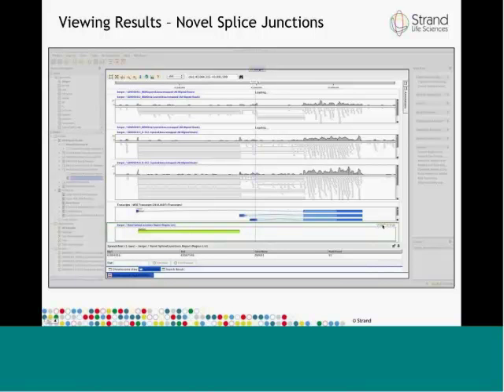There are also these maximize, minimize buttons, and I've used the minimize buttons to minimize some of the samples. Recall that I had 5 samples in this experiment, and I've minimized a couple of samples.